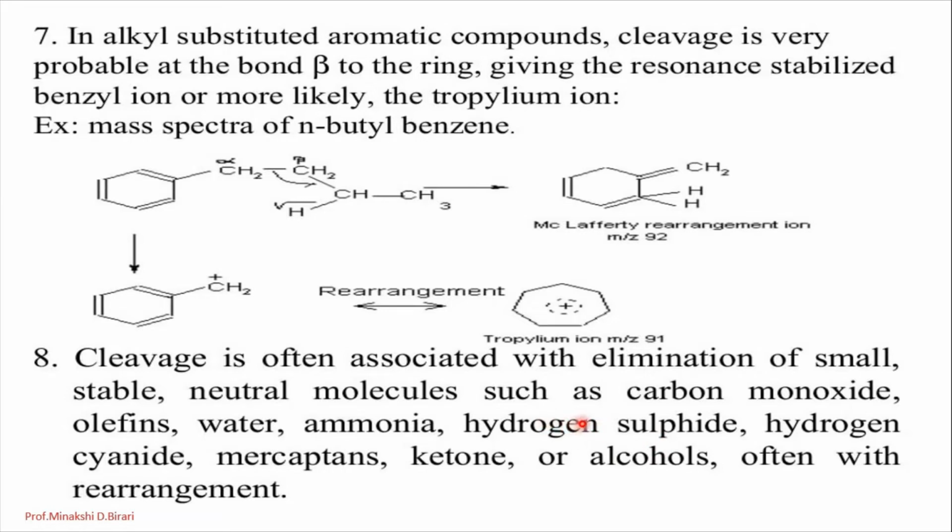For example, carbon monoxide CO, olefins, water H2O, ammonia NH3, hydrogen sulfide H2S, hydrogen cyanide HCN, ketone functional groups, or alcoholic functional groups that will be removed simply by rearrangement. So the cleavage is associated with the elimination of small, stable, neutral molecules.